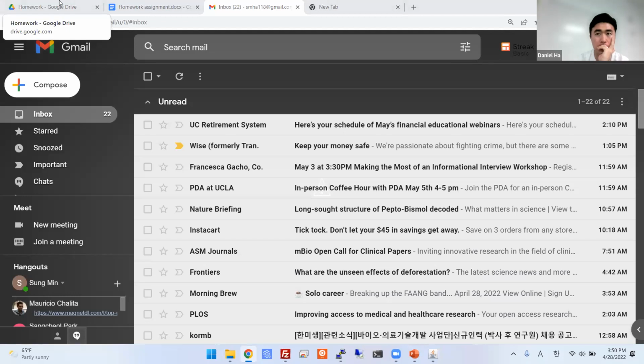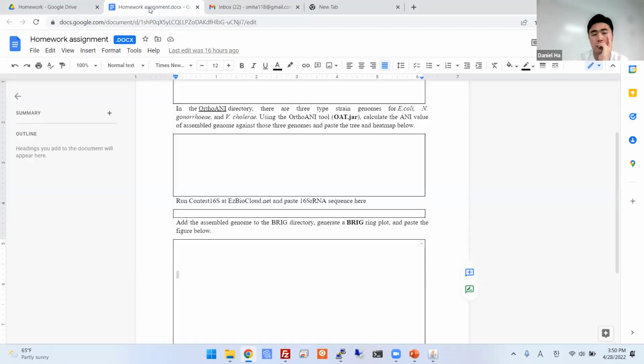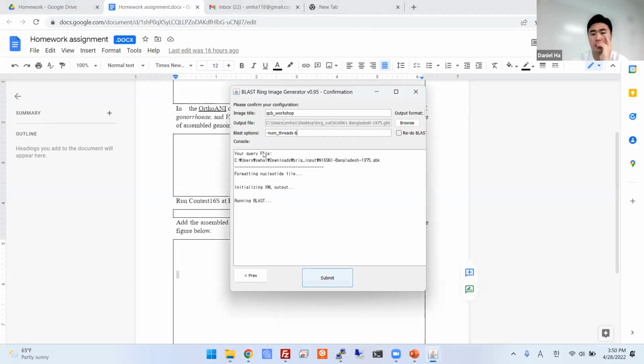So that's pretty straightforward, I guess. I got some weird VM error. This ran really quickly when I set 8 threads, but I got some weird VM error when I tried to render the image. It says it could not reserve space for the object heap. That looks like an OS issue. How much memory do you have? I have maybe this laptop with 8 gigabytes. Possible. Maybe I'll try it again with 4. Sure, yeah, give it a shot.